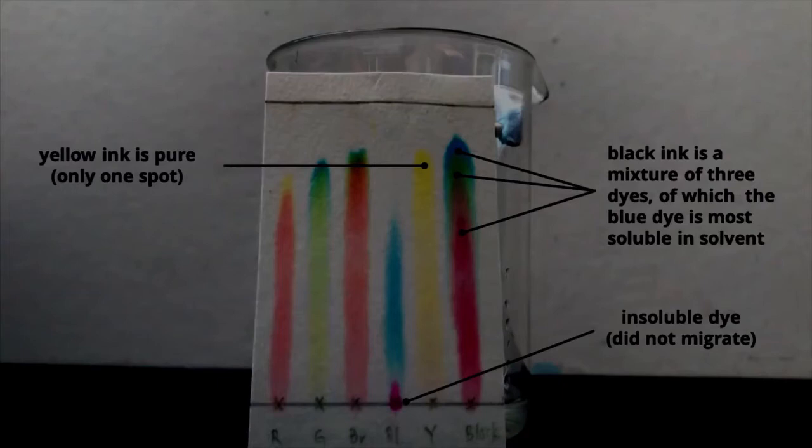The blue ink is a mixture of two different dyes, one purple and the other blue, and the purple dye is insoluble in water as it did not migrate and remained at the start line. For the dyes which were not well separated, we can consider doing this experiment with a different solvent.